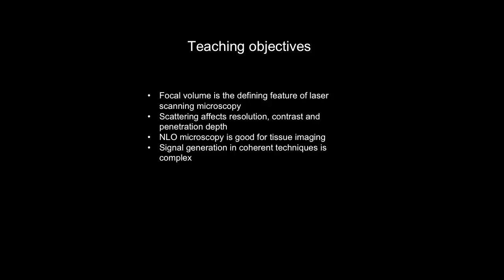Oh yeah, I wanted to mention that. We do nonlinear optical microscopy with mode-locked lasers with short pulses, because we need a large flux of photons at the focal point, and for that we use high peak power. Power is energy per time, so you can get high peak power by increasing the energy or by shortening the time. With short pulses, we deliver light through short bursts of energy.